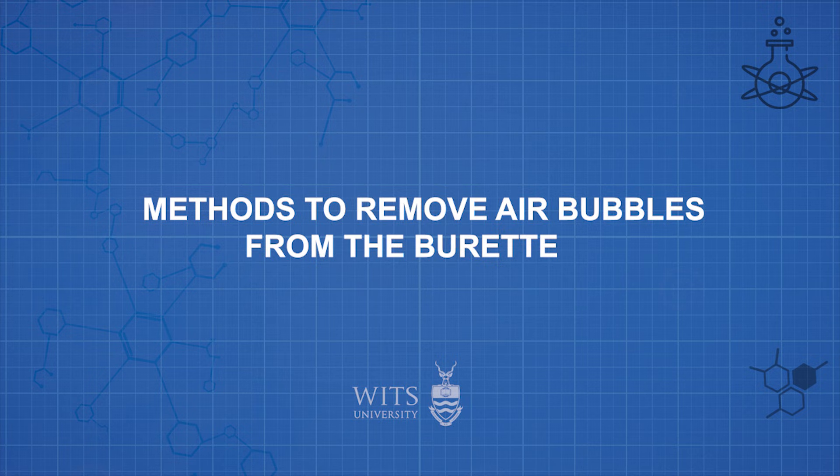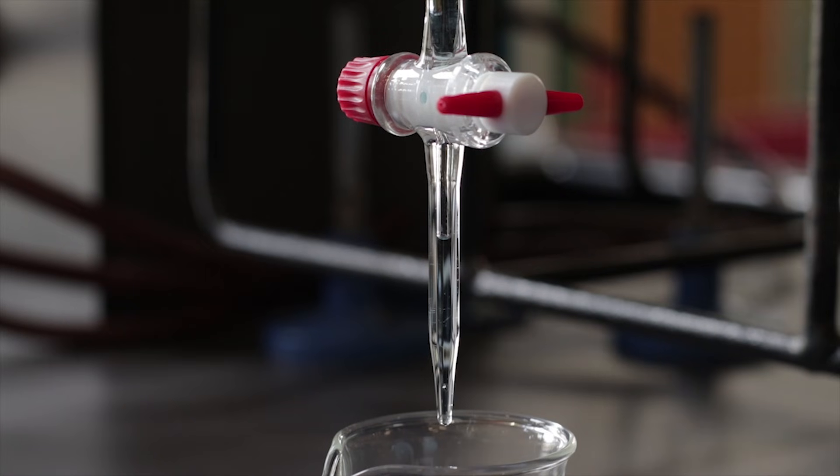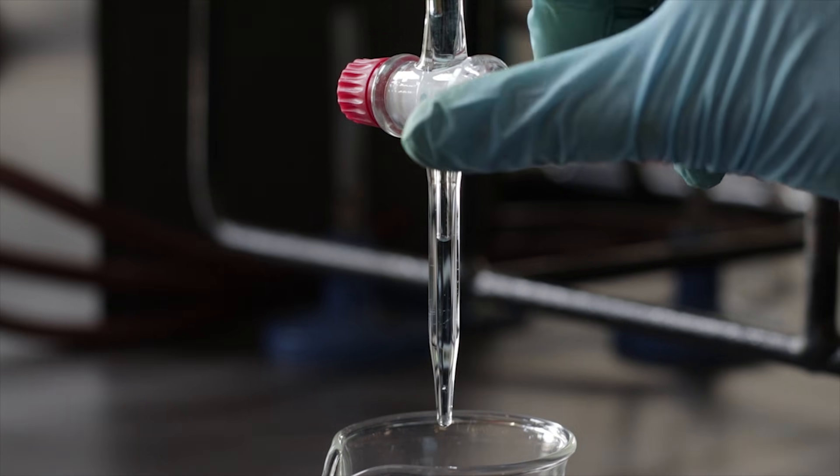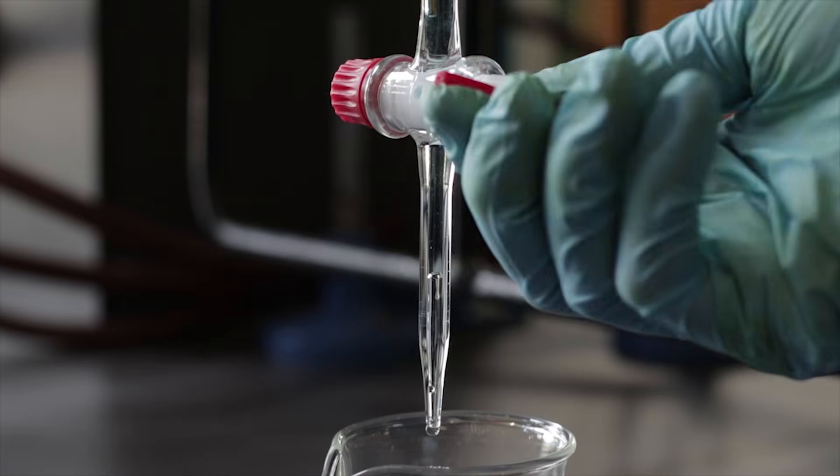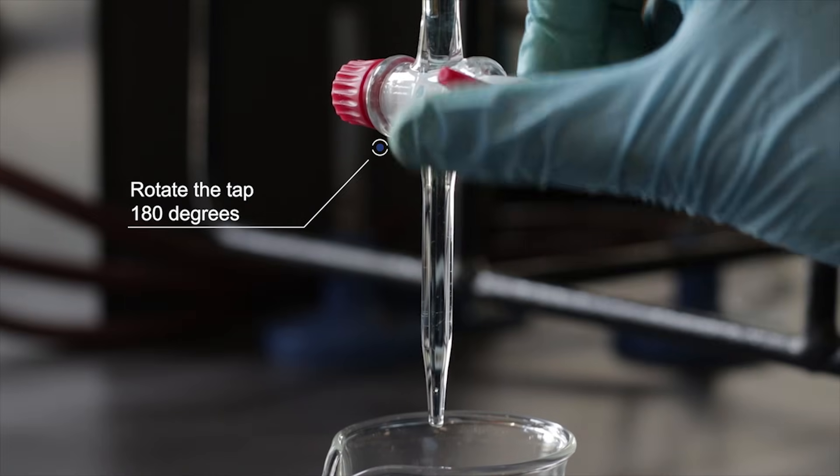If there are any bubbles in the burette there are three methods that can be used to remove any bubbles. The first method is to try to turn the tap on and off quickly rotating the tap 180 degrees.